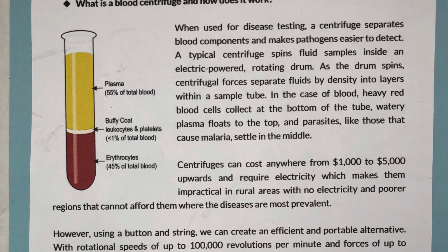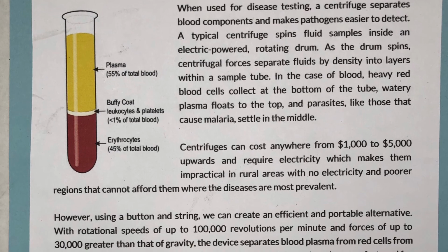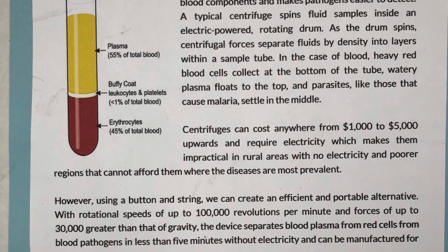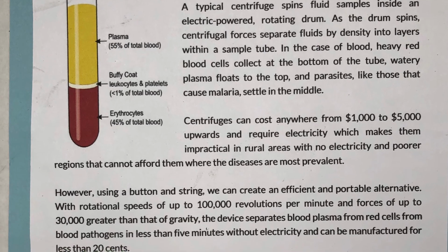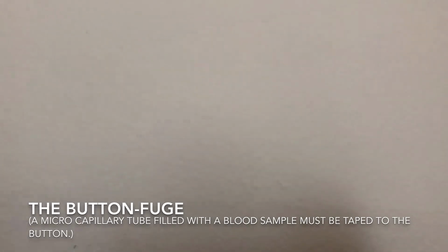Typical centrifuges can cost anywhere from $1,000 to $5,000 upwards and require electricity, which makes them impractical in rural areas with no electricity and poorer regions that cannot afford them, where the diseases are most prevalent. However, using a button and string, we can create an efficient and portable alternative.